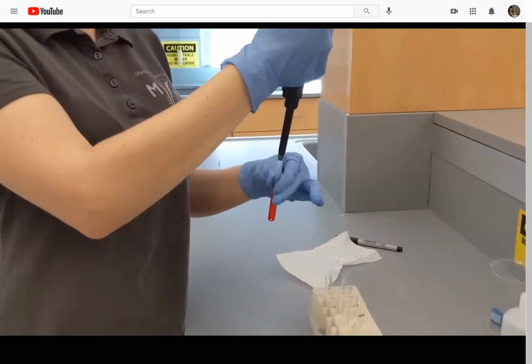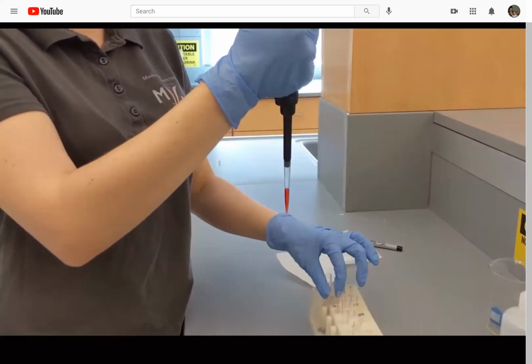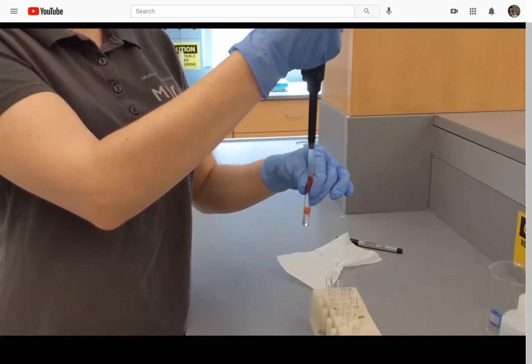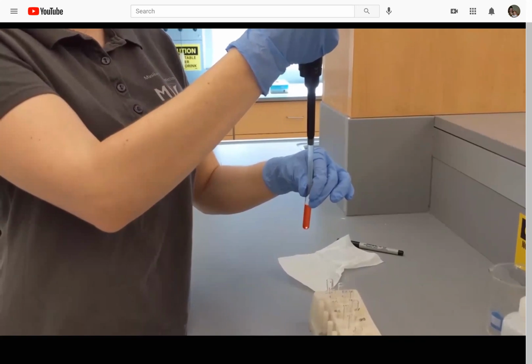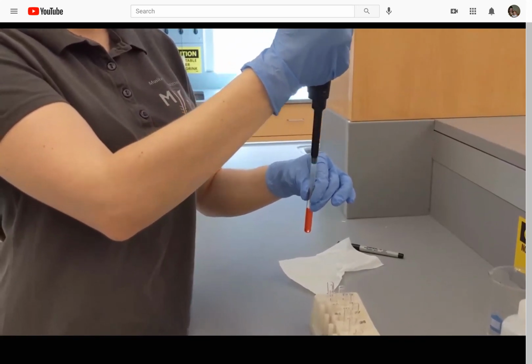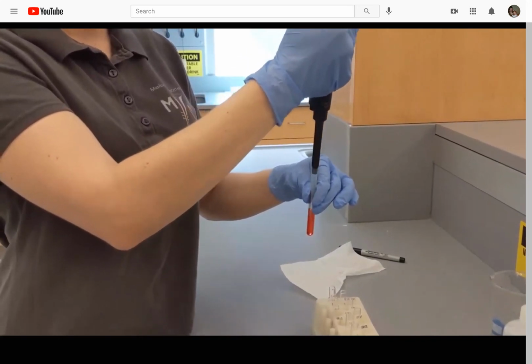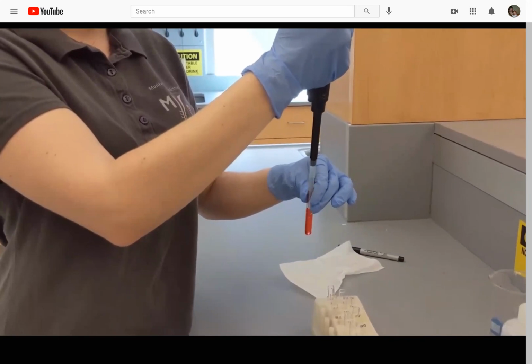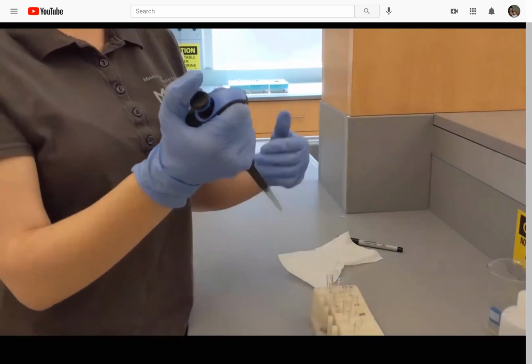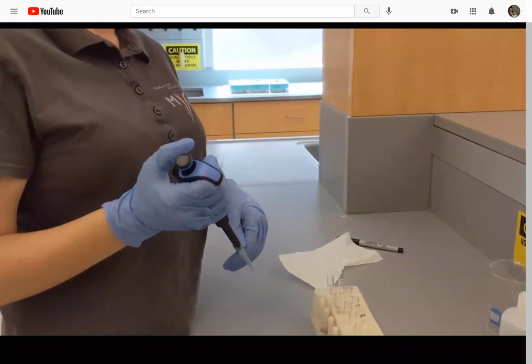All right, I'm now going to take 500 microliters of my freshly made solution. I'm going to add it to my third test tube, mixing it. And so on and so forth. I'm going to make 9 of these dilutions. And this is what's known as a serial dilution, because I'm taking one solution, making a new one, then using the new solution to make a third, so on and so forth.